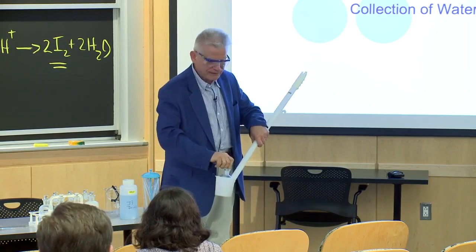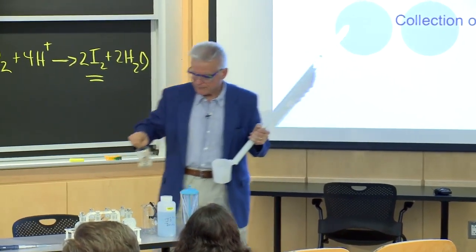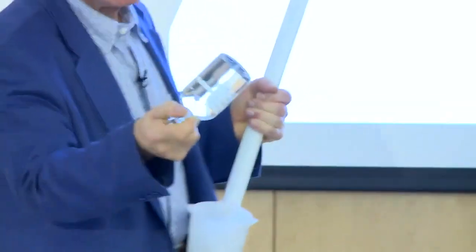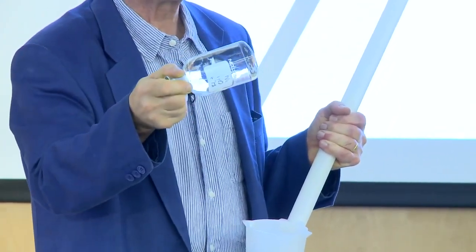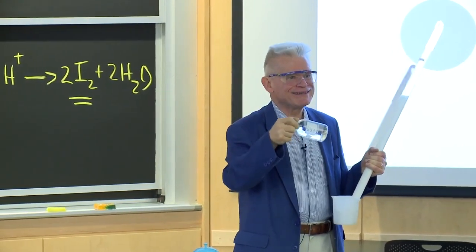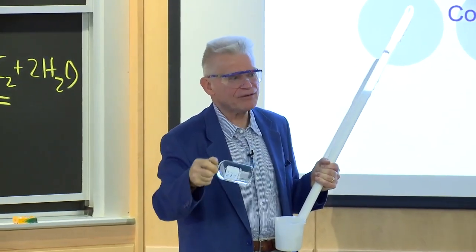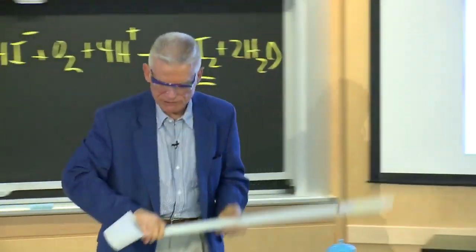So I stoppered mine underwater. I bring it up, take it out, and then I take the bottle, and I do this test. I don't see any bubbles. That's a good sign. That means it's perfect. If you see bubbles, you've introduced more oxygen in there. Your DO concentrations are going to be too high. Pour it out and restart again. Okay, so that's the collection.